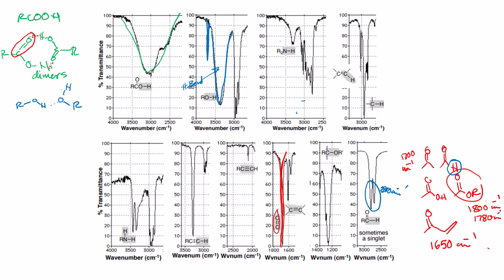Going into the nitrogen-containing compounds. Let's say ammonia. Here we have it. But if I replace one of the H's by an R group with carbons, this is a primary amine. And a primary amine has two H's, and therefore two important vibration modes, and that gives rise to this double band at around 3400 centimeters -1. So that shape is very characteristic. Typically, you will see one shorter than the other, like that.